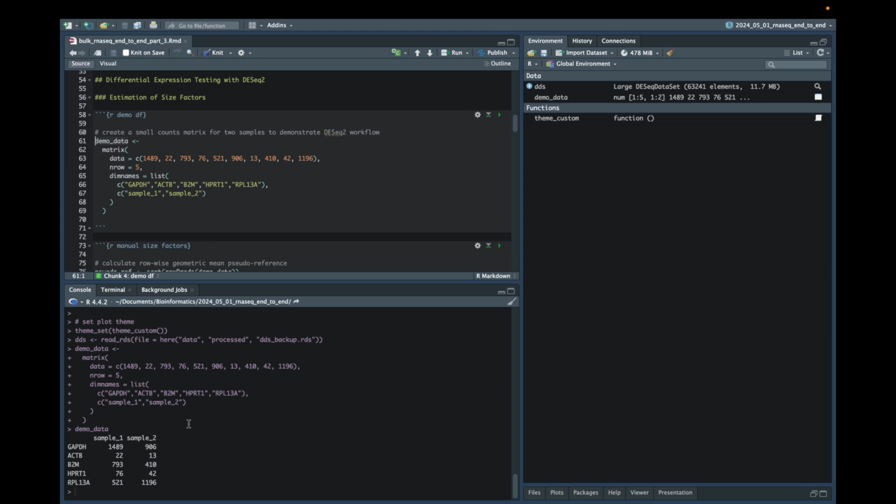factors are computed. The size factors are scaling factors that normalize the raw read count data to account for the differences in sequencing depth and other technical biases across samples. This is what we refer to as normalization. And this normalization step is crucial to ensure the comparisons of gene expression levels between samples are accurate and not confounded by technical variability. The size factors are calculated based on the median ratio of gene counts relative to a gene-wise pseudo-reference sample, the gene-wise geometric mean across all samples, within DESeq2, which helps in achieving a comparable scale across all samples in the dataset.